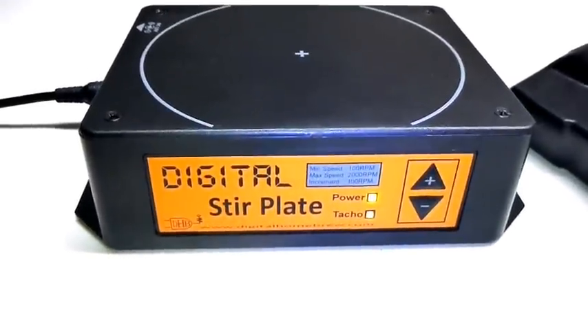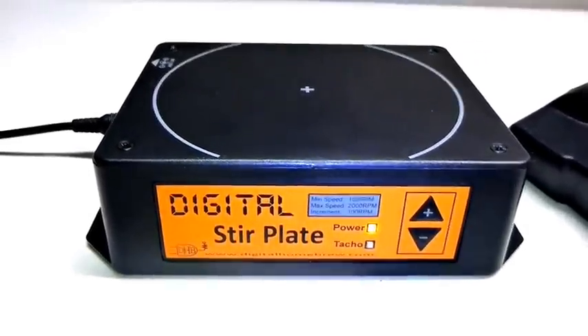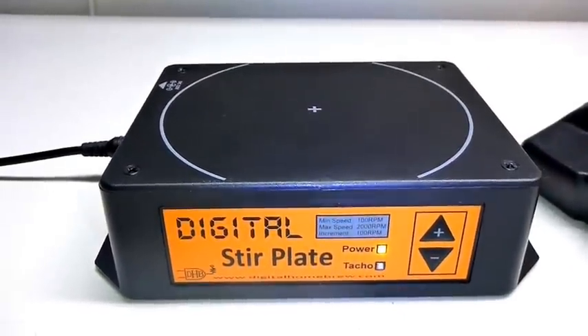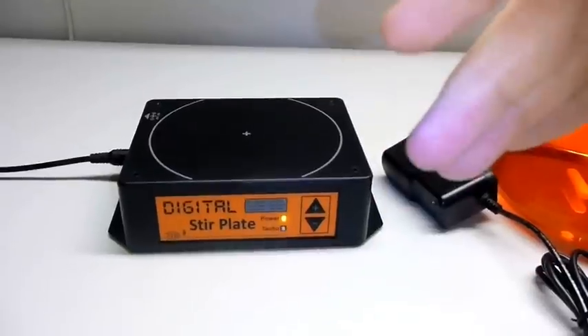The benefit of this is going to be consistency when you're making yeast starters — it's easy for you to choose a speed, and next time repeat that speed. The stir plate is going to do everything it can to lock onto that speed and maintain it consistently, so you'd have a similar amount of aeration going on or gaseous exchange.